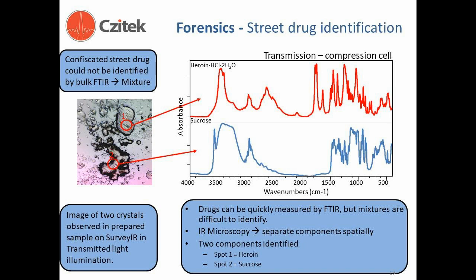Mixtures are very common in narcotics investigations and are problematic for conventional infrared spectroscopy analyses because the spectrum exhibits contribution from two or more materials. With FTIR microscopy, mixtures can be analyzed conclusively and rapidly, by separation of the components under the microscope, and recording their spectra independently.